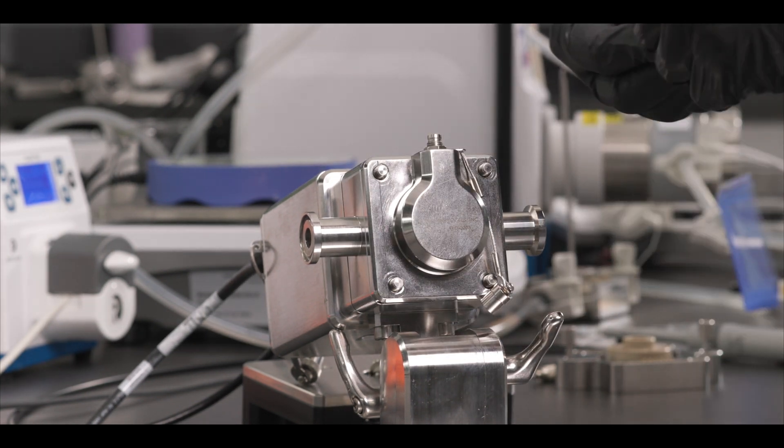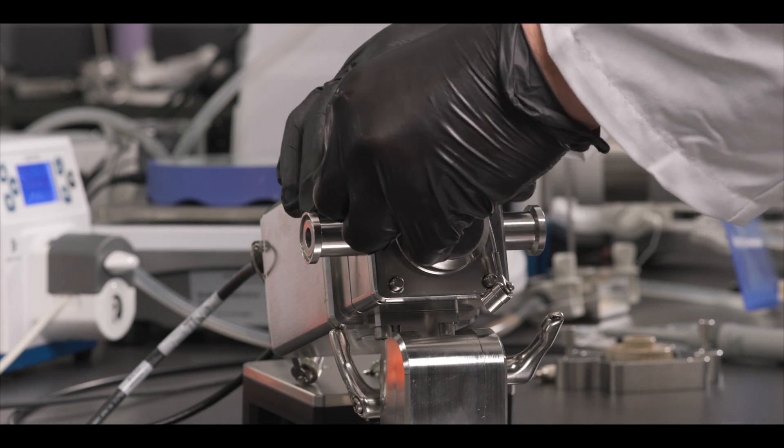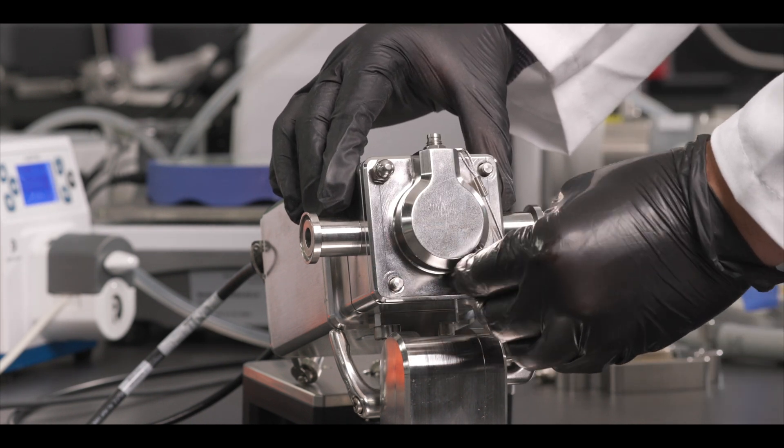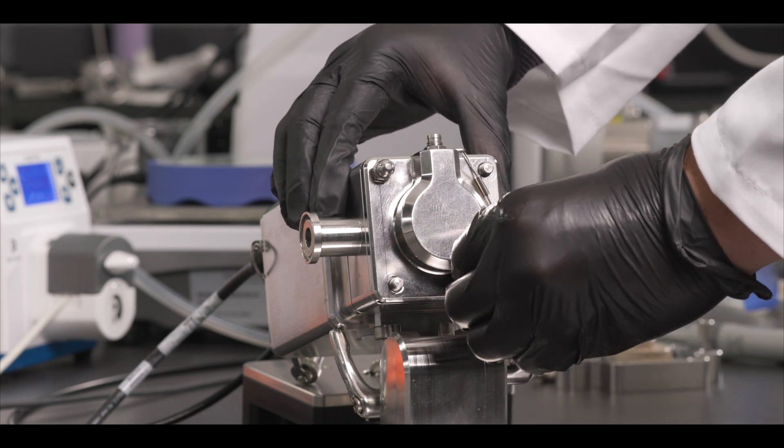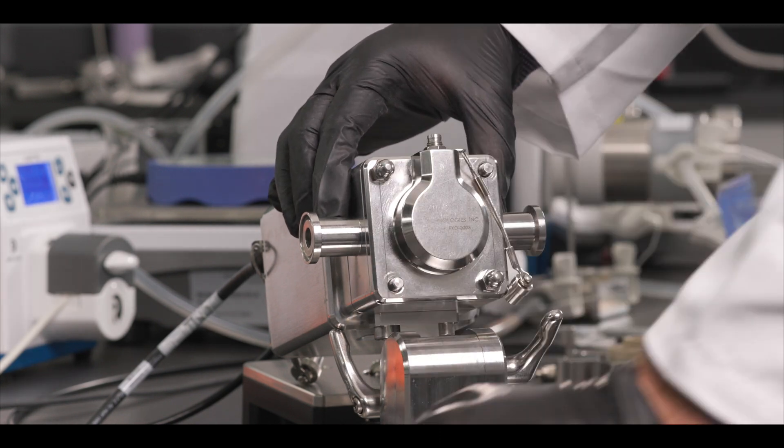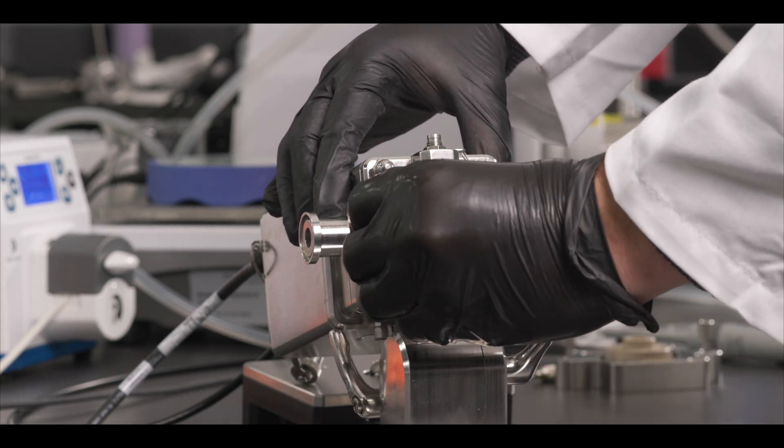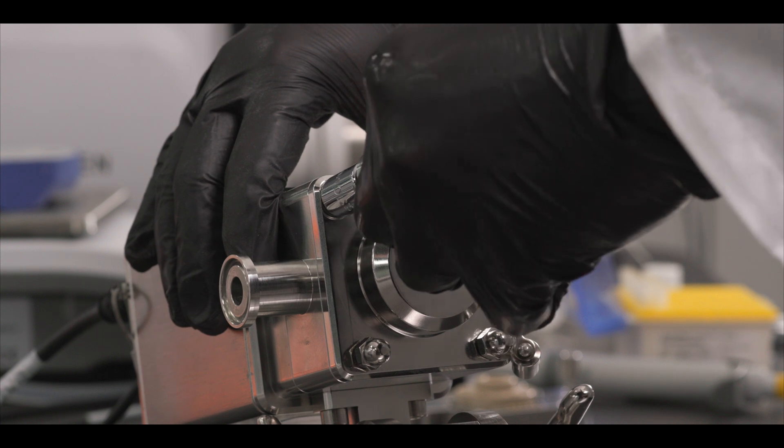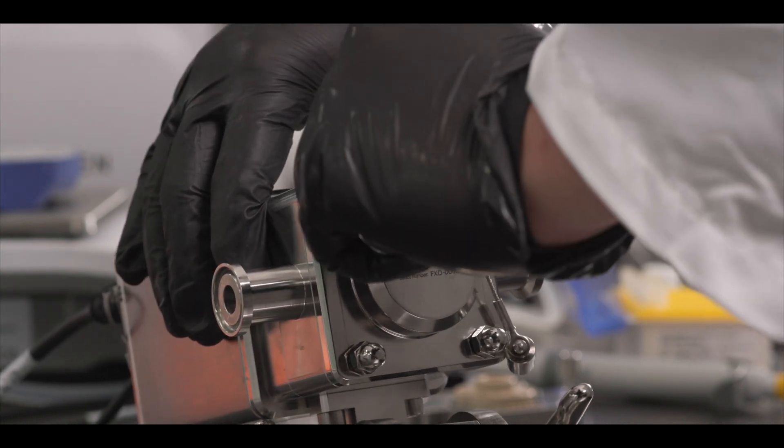Secure the flow cell detector in the FlowVPX with the four acorn nuts and tighten with the provided 40 pound torque wrench. Tighten in a diagonal pattern to equally distribute the torque.